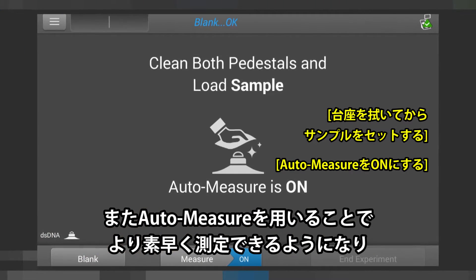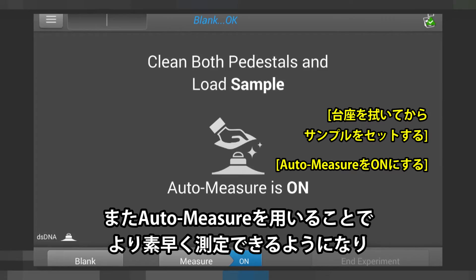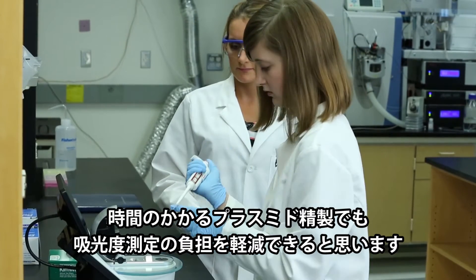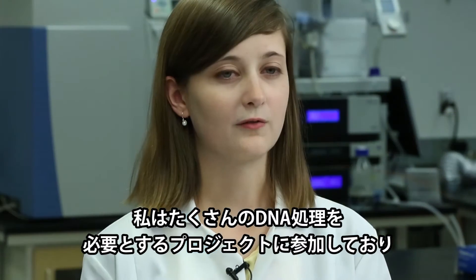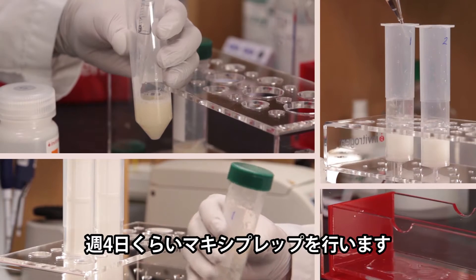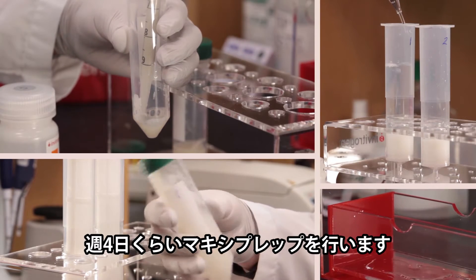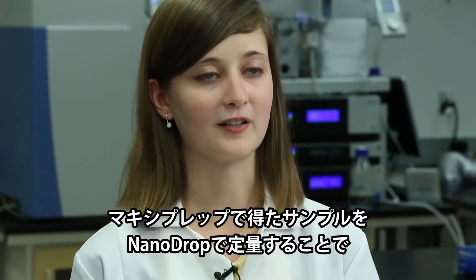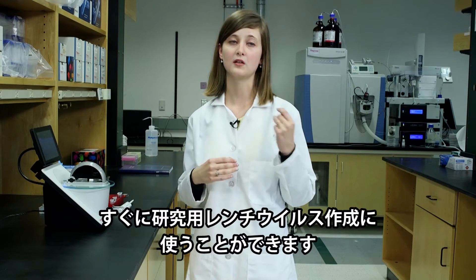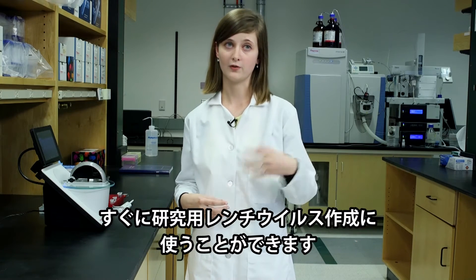I feel the auto measure makes sampling faster and easier, which can be helpful after doing a long plasmid purification. I'm working with an investigator on a project that involves lots of DNA work. We do maxi preps probably four days out of the week. The products of those maxi preps need to be nano dropped right after so we can use that to make lentivirus for our work.